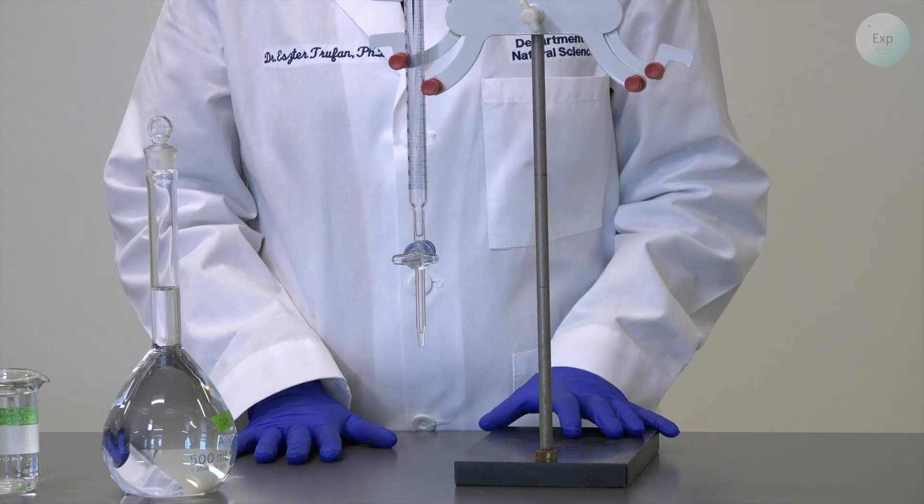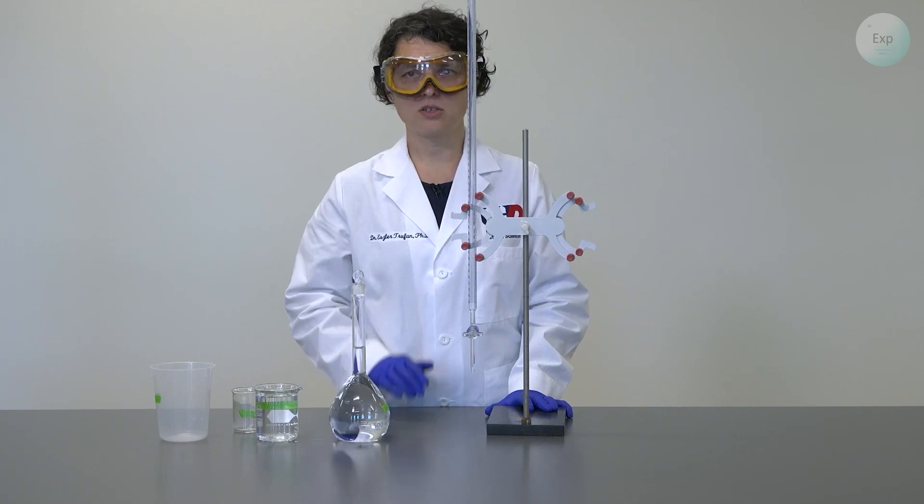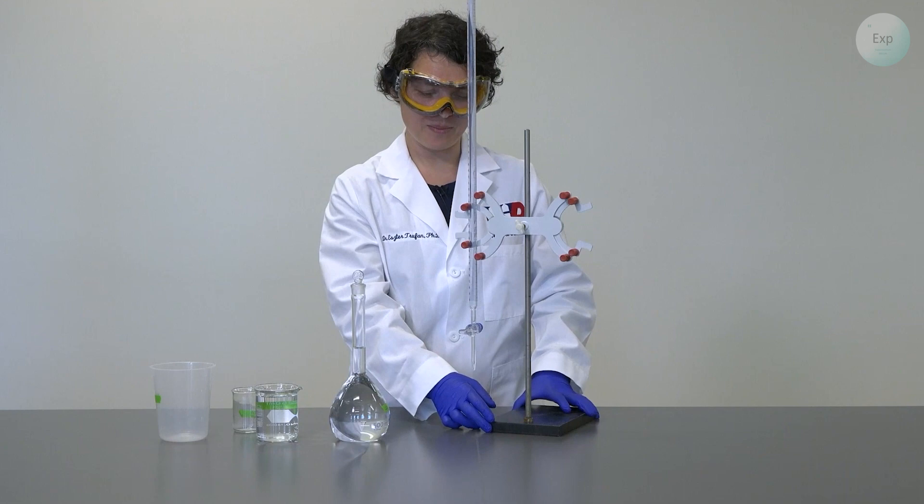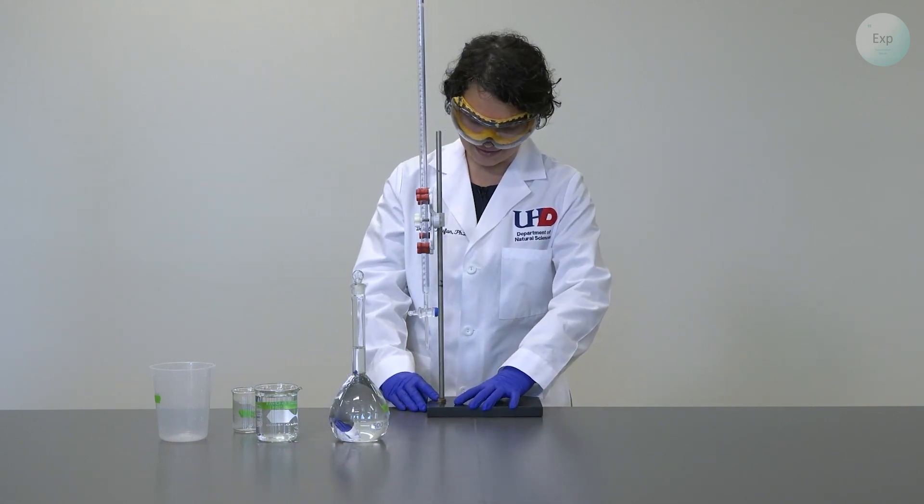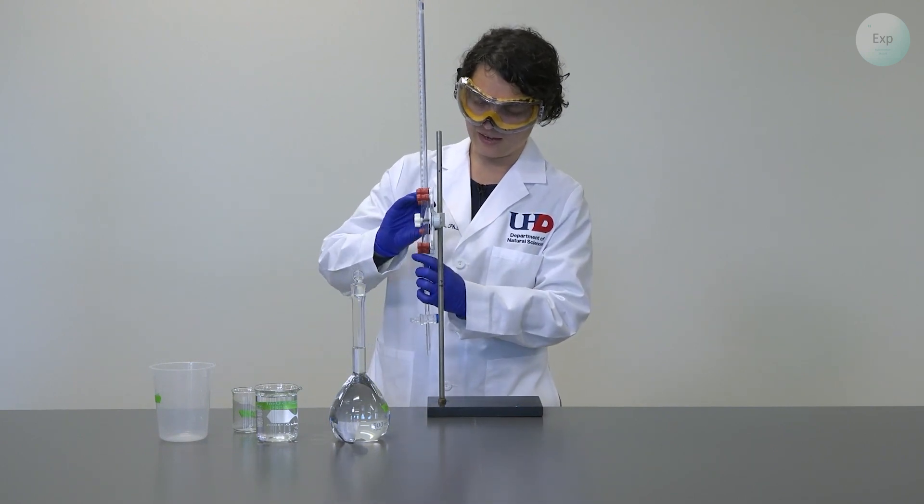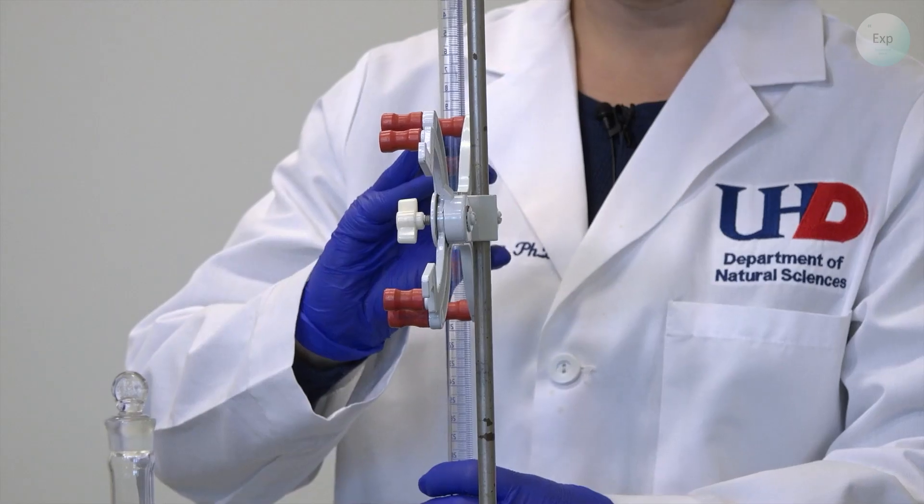The next thing we have to make sure of is that we don't pour anything above eye level. And to get to that point, we need to make sure that for those of us who are height challenged, the burette can be lowered, and we should be able to see the top of it.